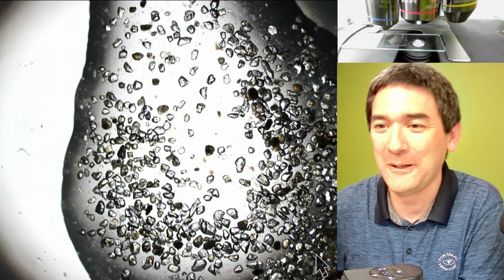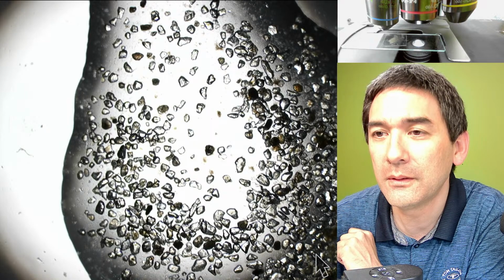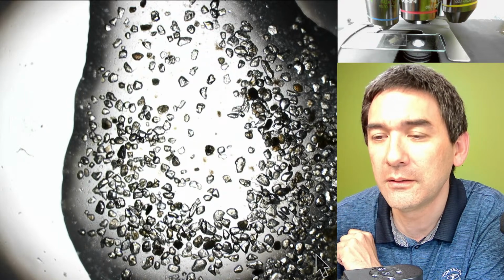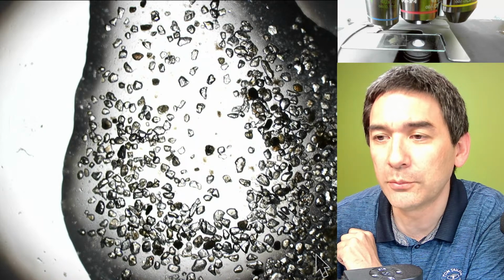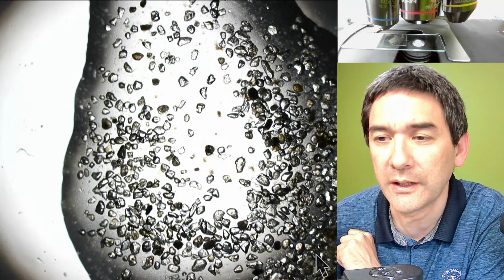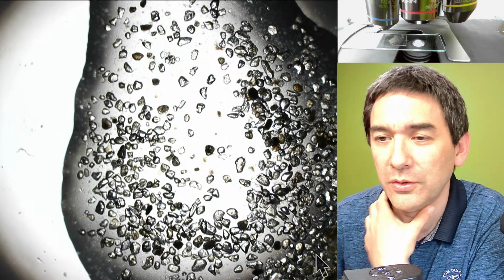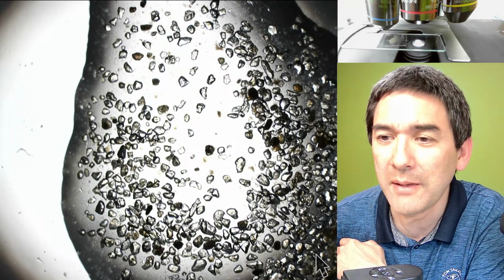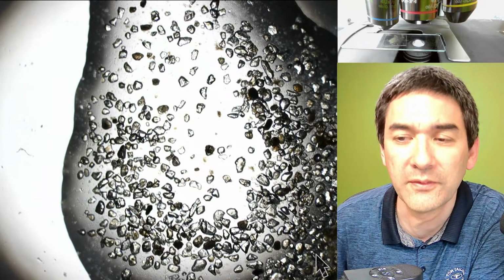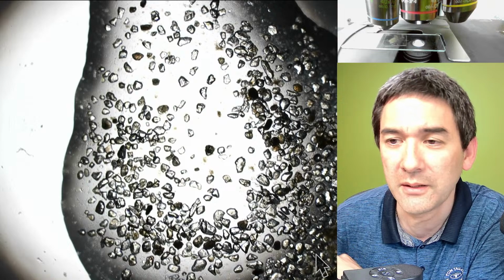So let me quickly check again. The bottom right of this corner, oops, I think I overlooked that. It has a full circular diatom shell. Oh, didn't see that. So you know what? I might not throw it out right away. Maybe I'm going to take some time the next couple of days to check out some of the things. And if I see some nice diatom shells, I'm going to pick them out.